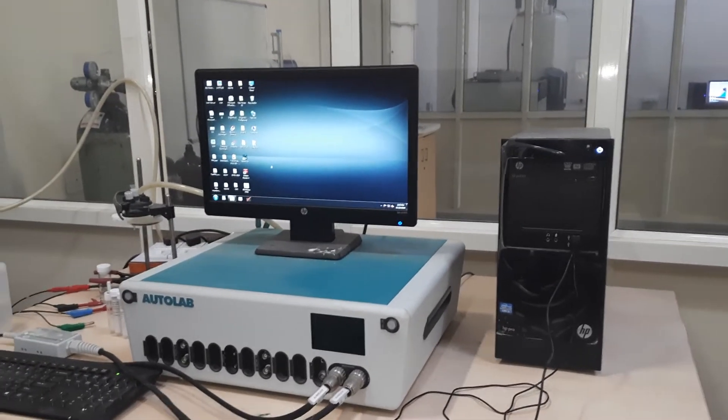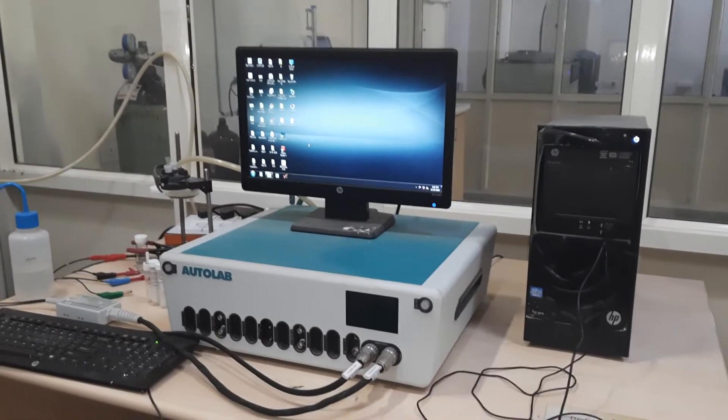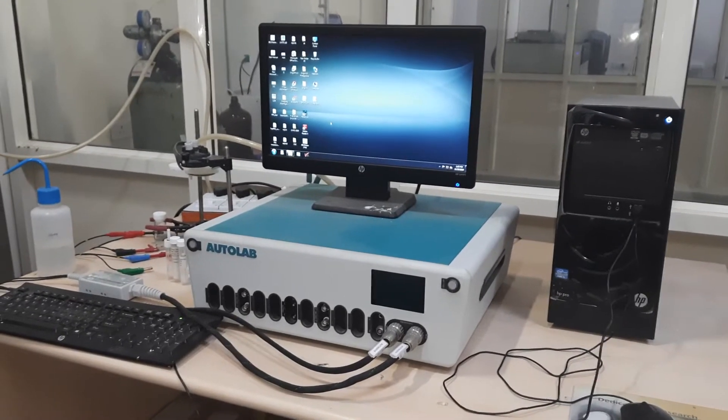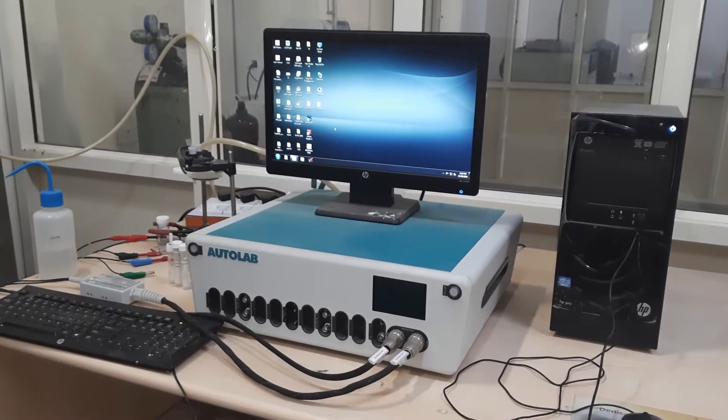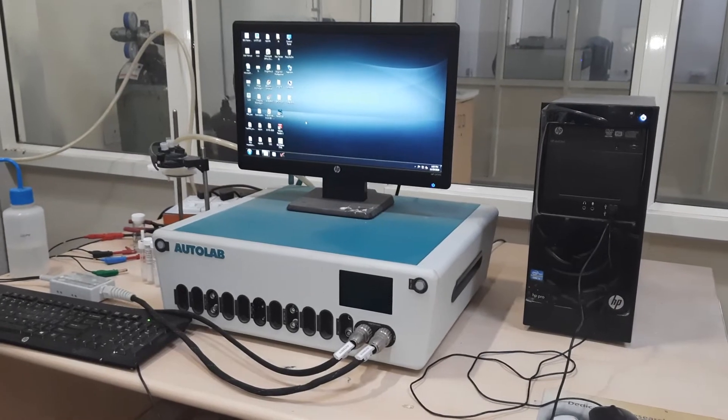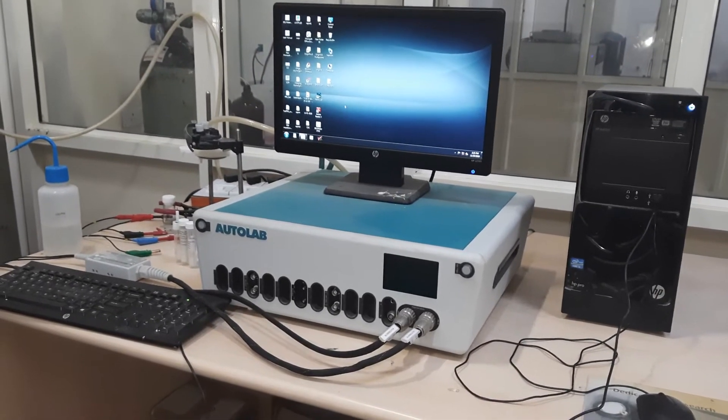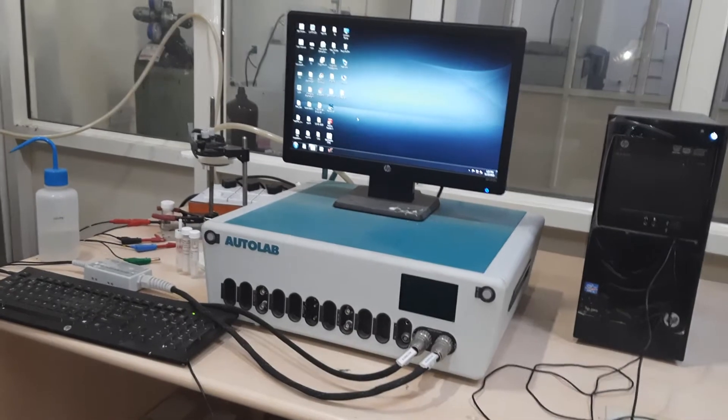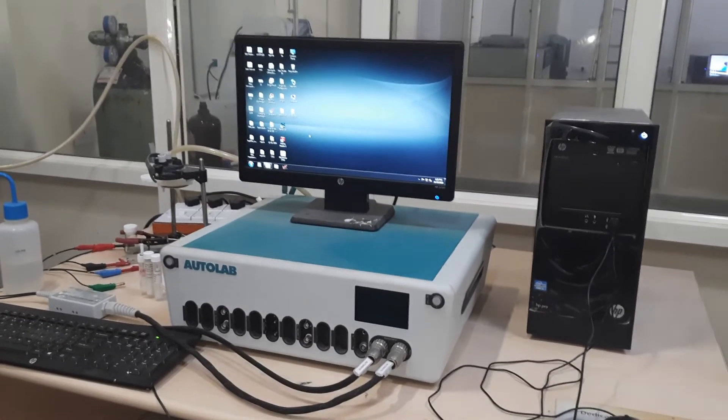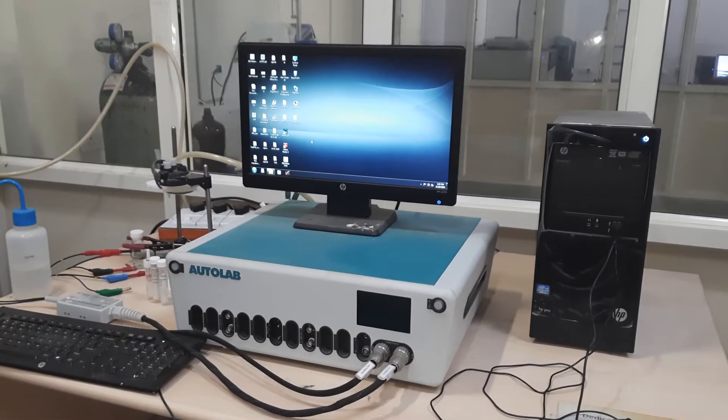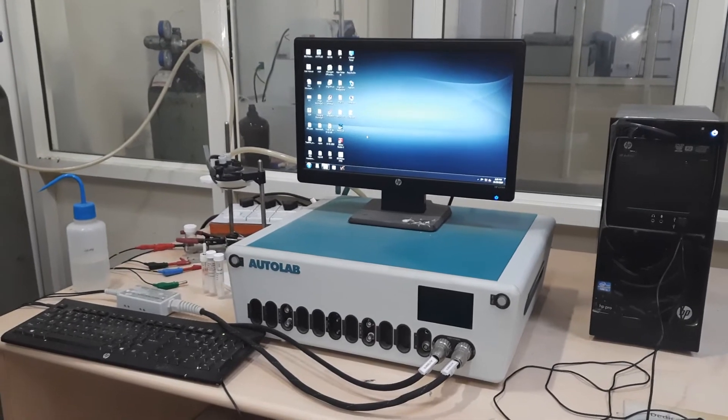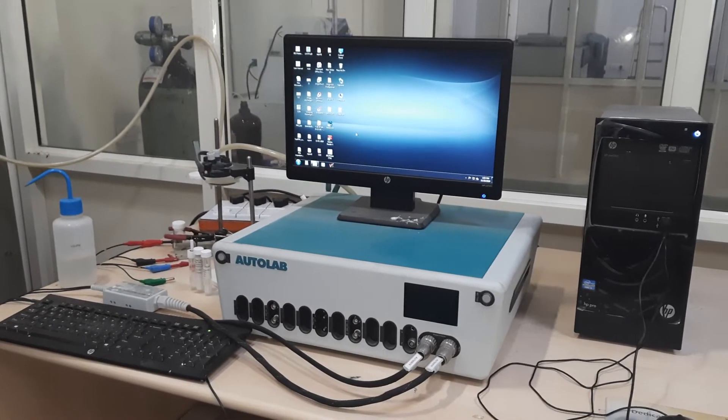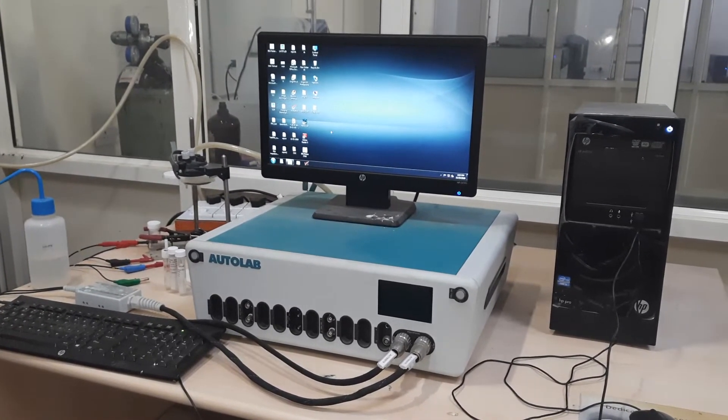This is the instrument from Metrohm, the Autolab, for electrochemical measurements. Today we are here to see how the Nova software is used not only for recording cyclic voltammograms and other electrochemical data.